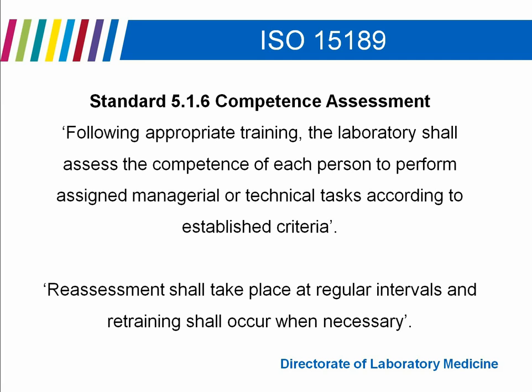This has caused some problem for ISO, and certainly was highlighted for some of the pilot sites that, okay, as biomedical scientists we can demonstrate our competency, but how do the medical staff do that, and so on. So it's spread the scope, in fact, to other grades of staff. It states reassessment shall take place at regular intervals and retraining shall occur when necessary.